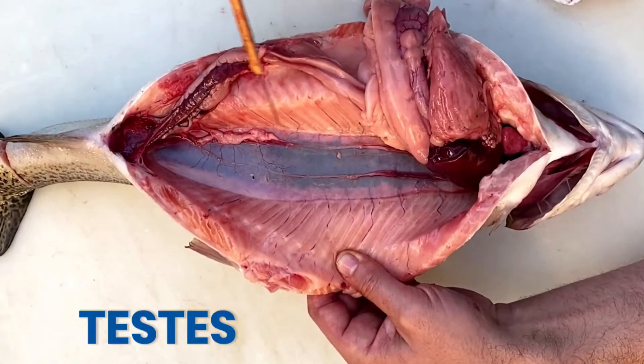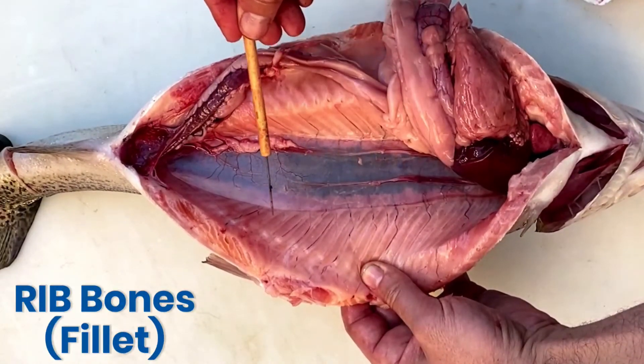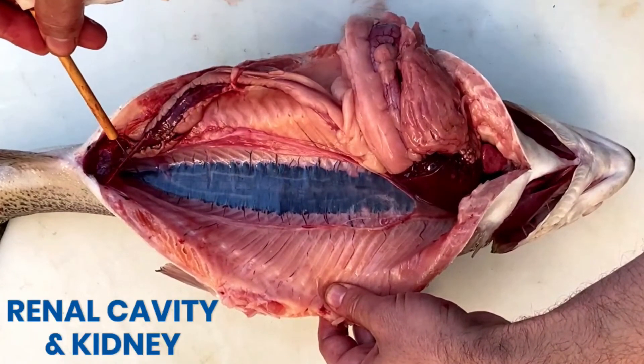Notice the paired testes that run along the ventral surface of the gas bladder. I've cut the gas bladder away so we can have a clear view of the steelhead trout's kidneys.